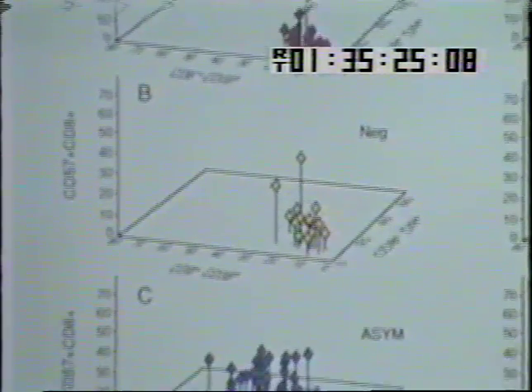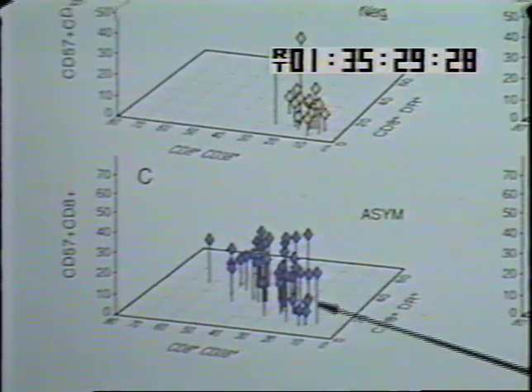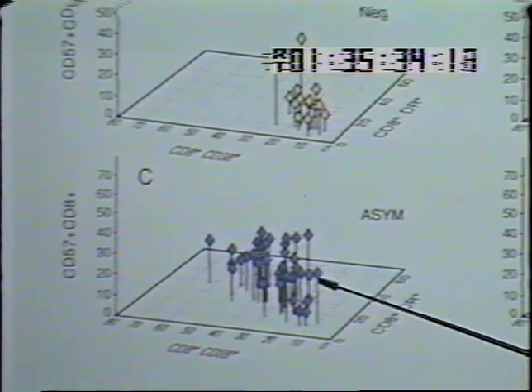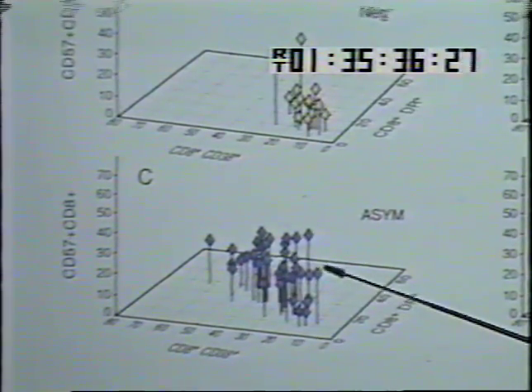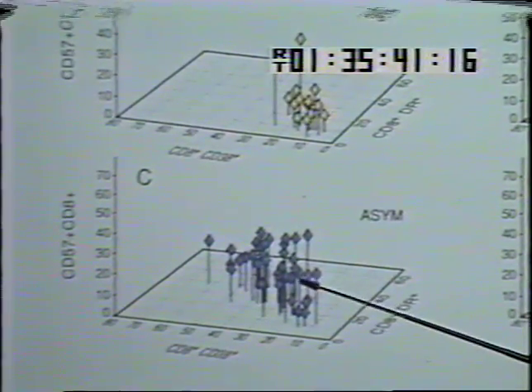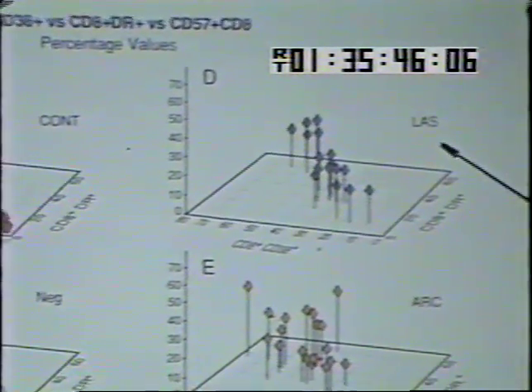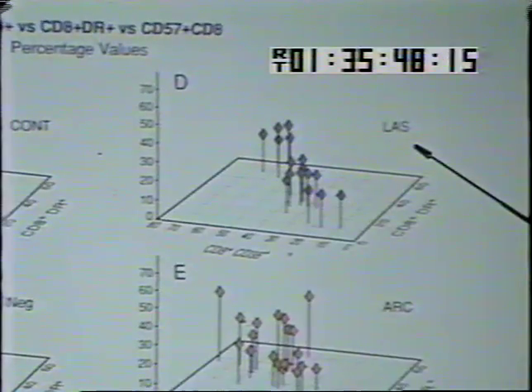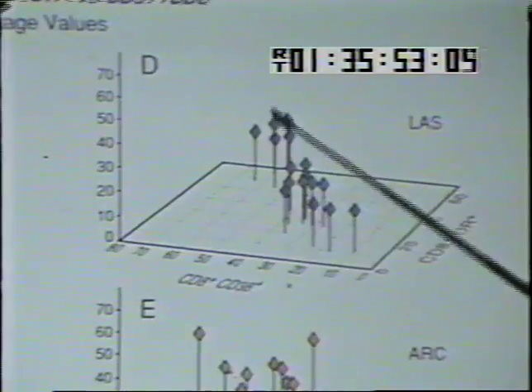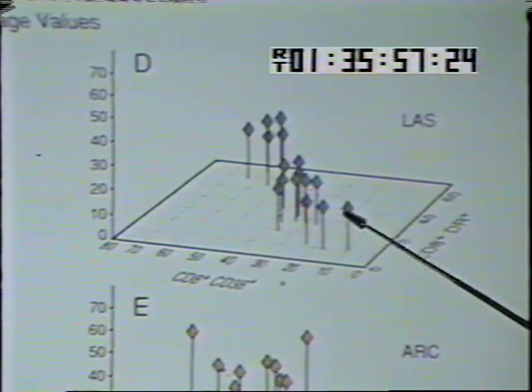However, after an individual has been infected with human immunodeficiency virus, or HIV, we can now see a spreading out of the immune response. Each of these diamonds represents an individual patient which has a certain value for an activation antigen. Notice as the disease progresses into more advanced clinical stages, here the lymphadenopathy phase, how patients can now be identified by a clustering of values. This suggests discrete states within the immune system which have been reached.